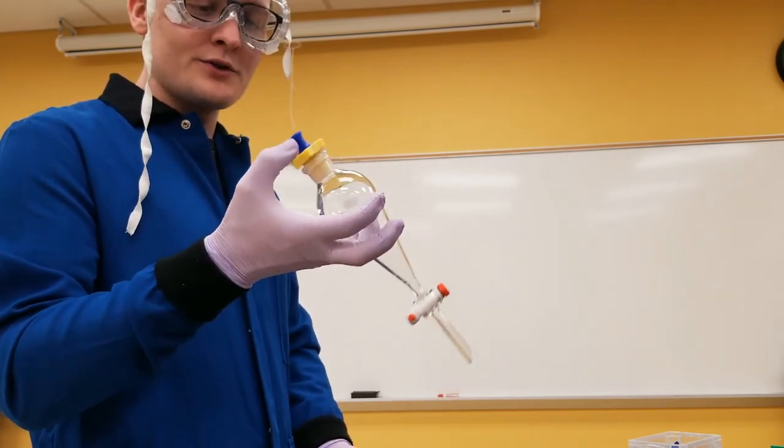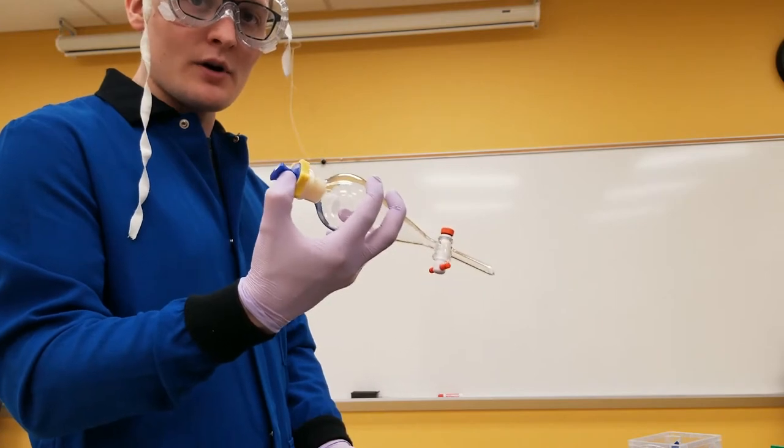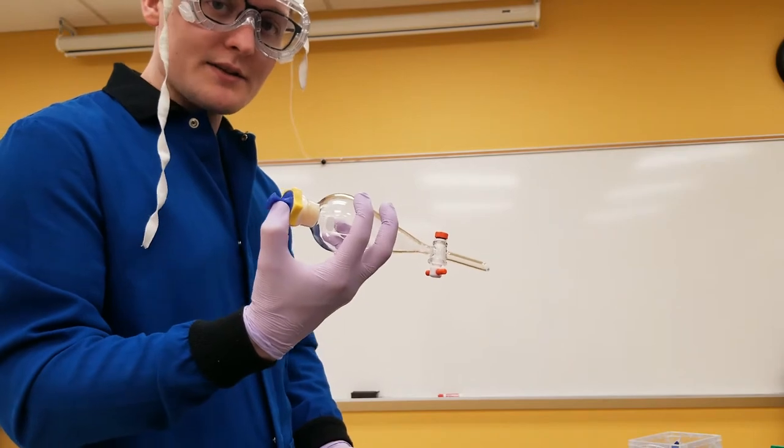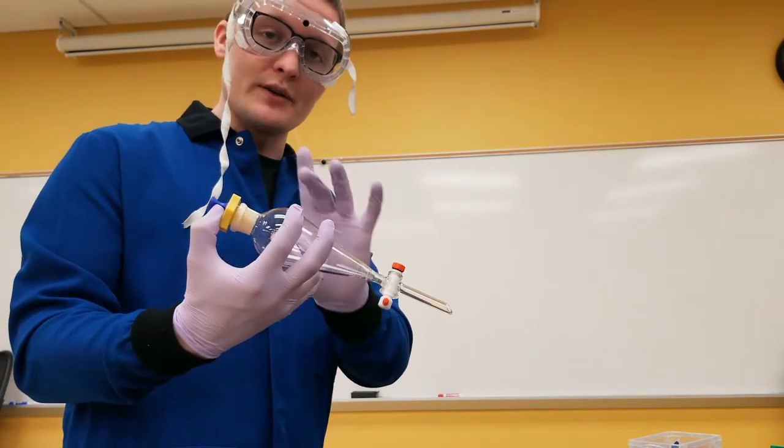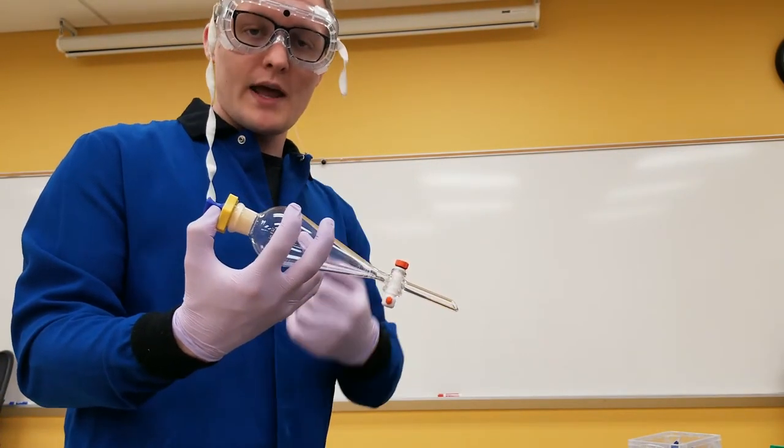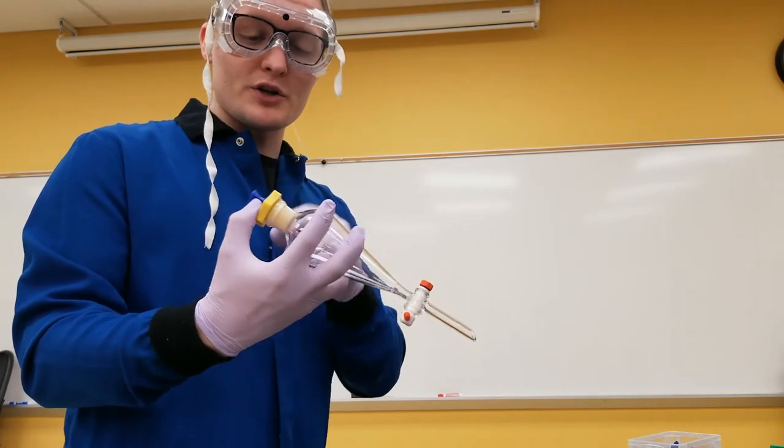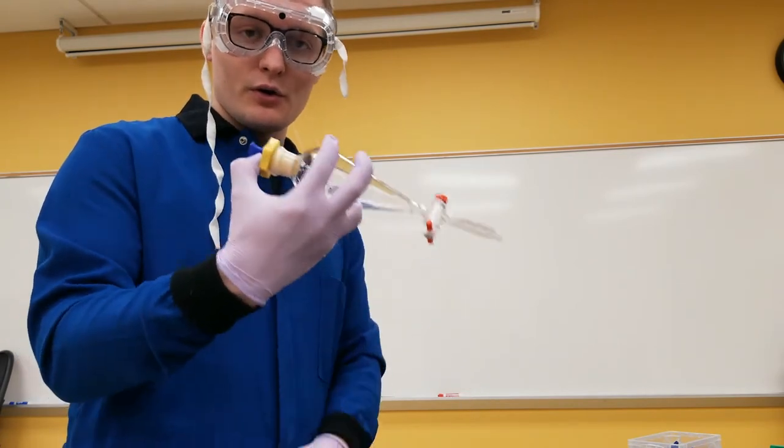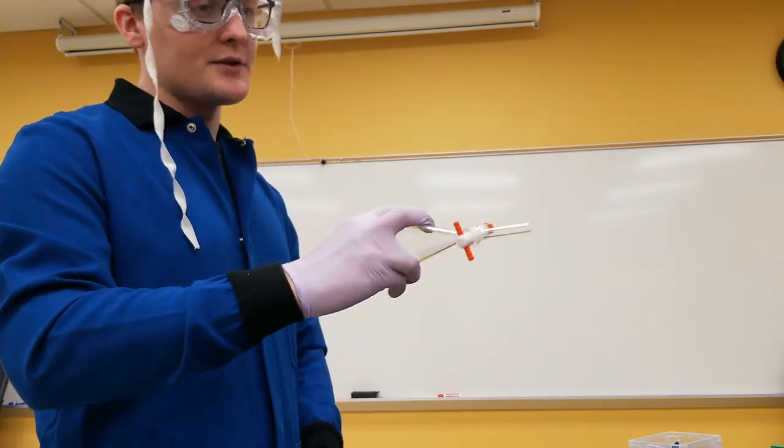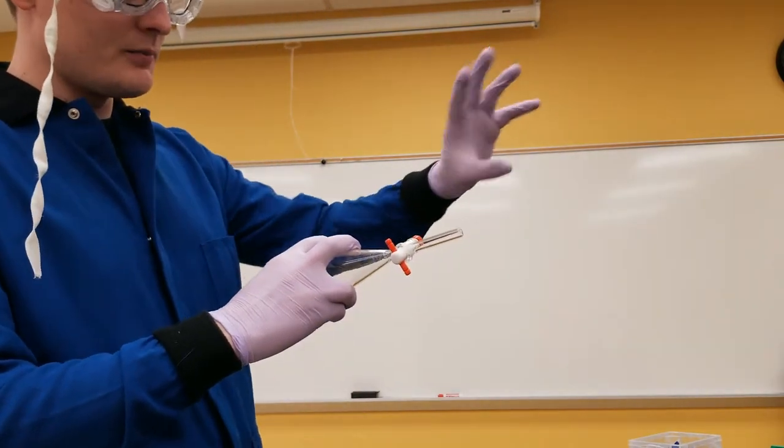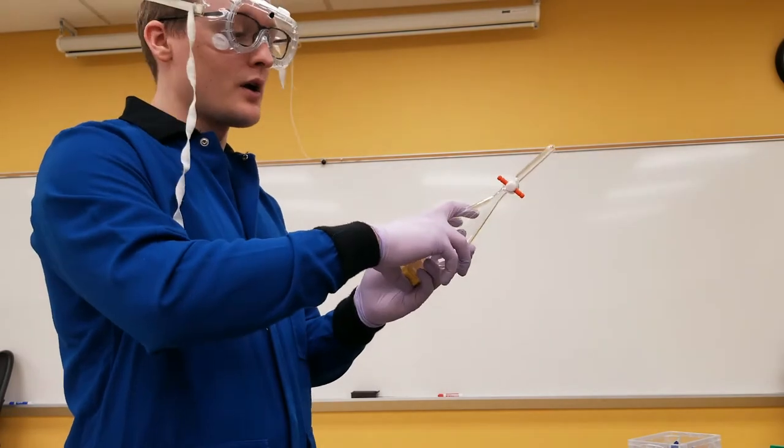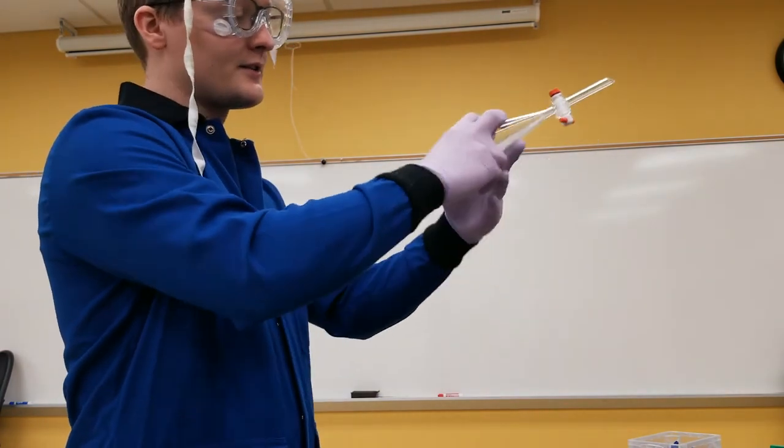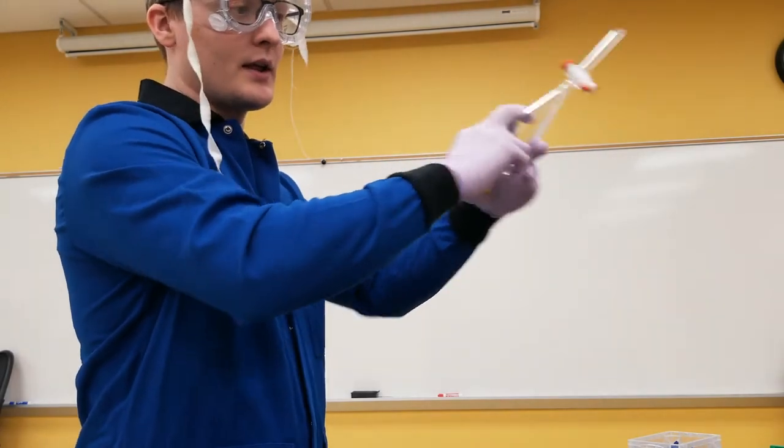I'm going to brace the stopper with my thumb because as you shake, depending on what you have in here, you can actually build up pressure in the chamber. And when you build up too much pressure, this can go popping off. So you're going to hold it with your thumb. The way that we shake is in a fume hood, which is going to be right here for right now. I'm actually going to invert it and I'm going to shake it like this, or more stably, like this.